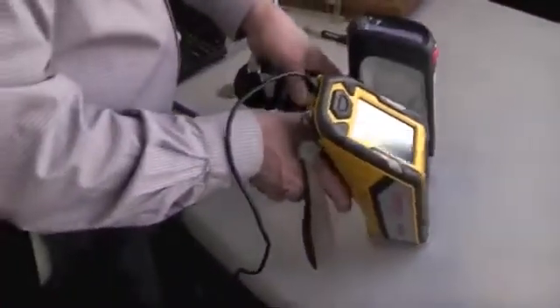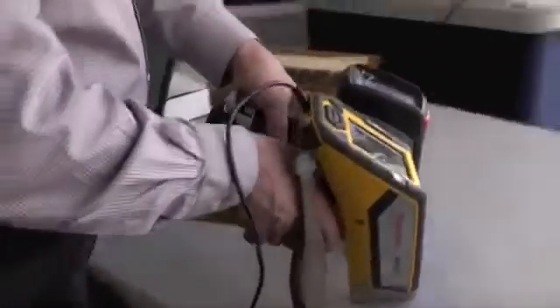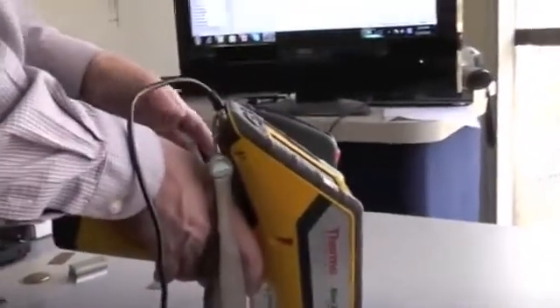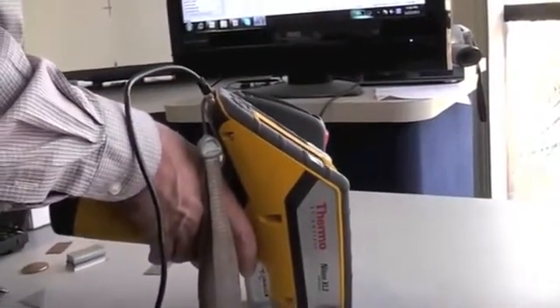Another thing you're going to notice with this system is the viewing angle. You can see how much different it is, how much poorer it is. It's a lot easier to see the Inovex system.